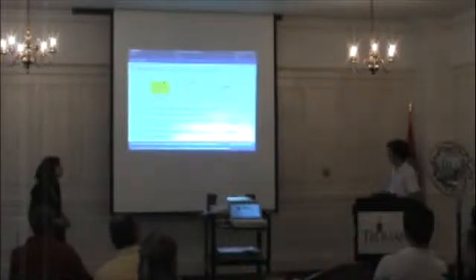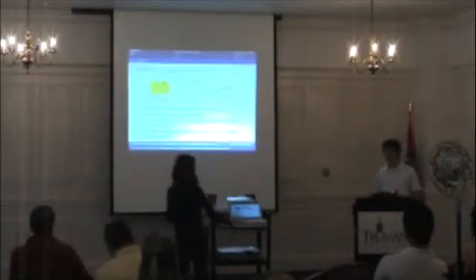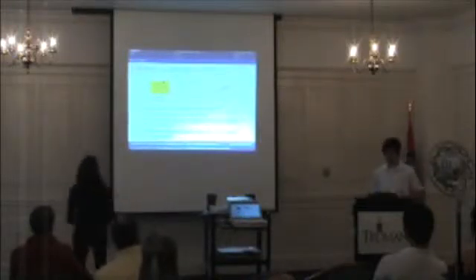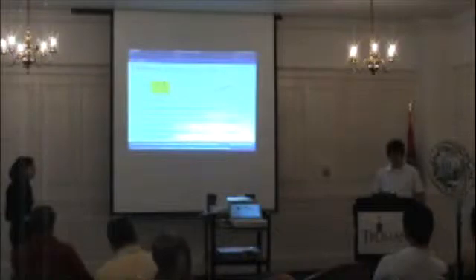Also, obtaining the embryos, which are not fully visible there, but the embryos are visible through the transparent cuticle, is a fairly simple process to do. It's easy. With a couple of days' work, you can turn it out pretty quickly. So obtaining the embryos that we need for the image segmentation is a relatively easy process.